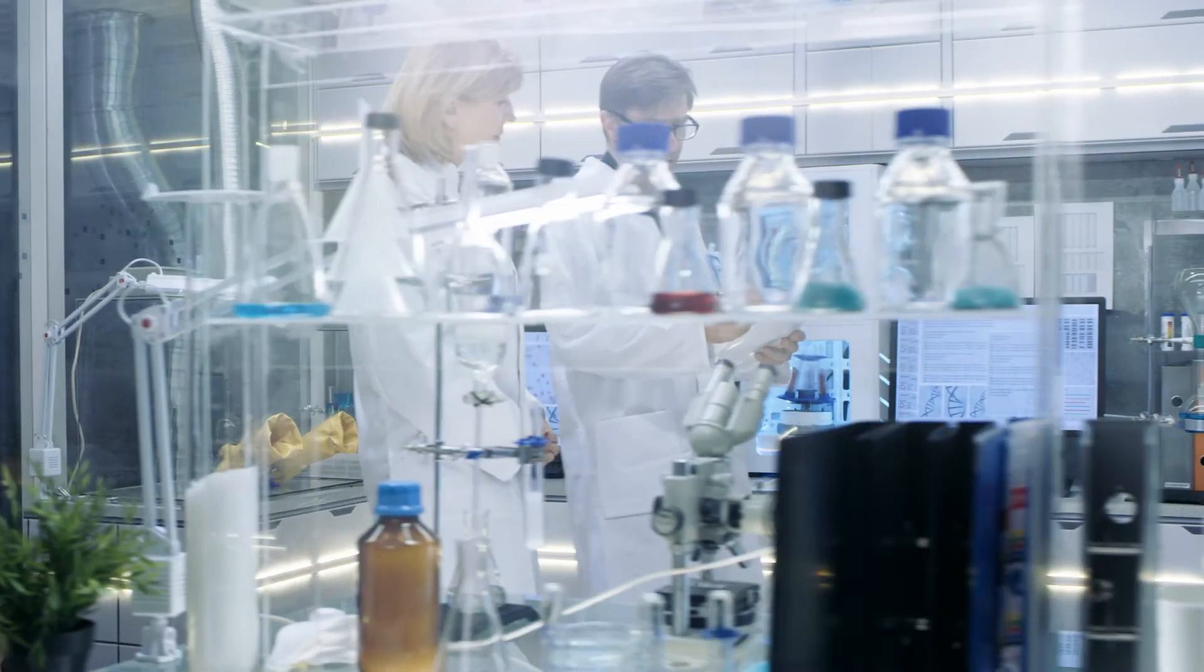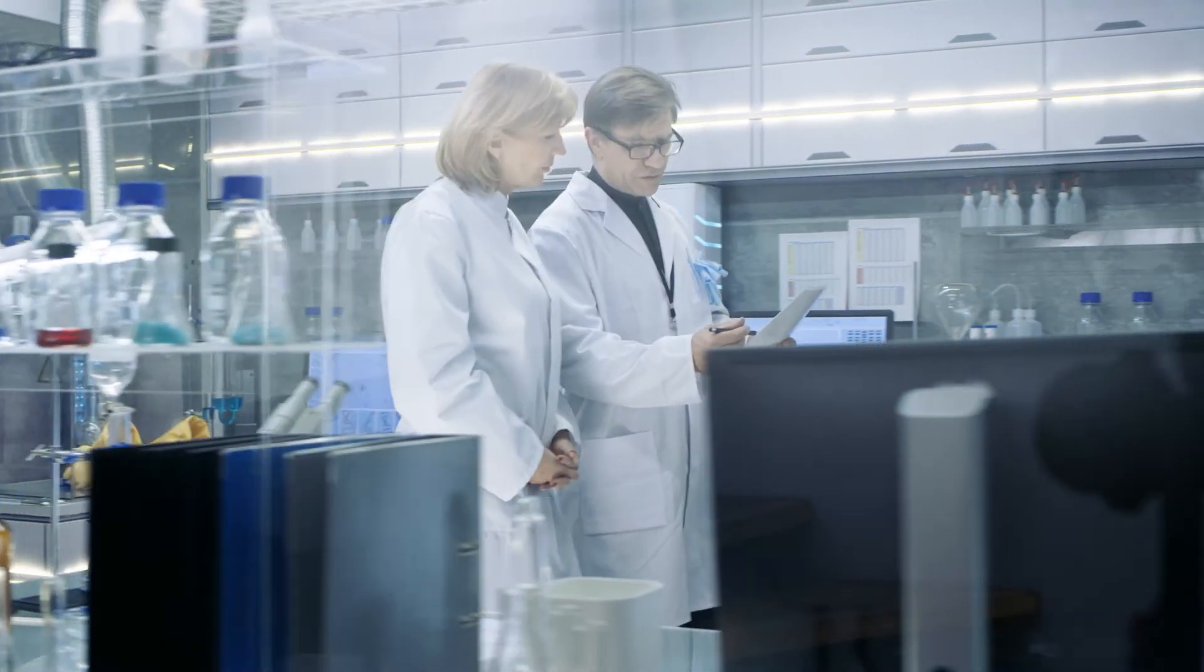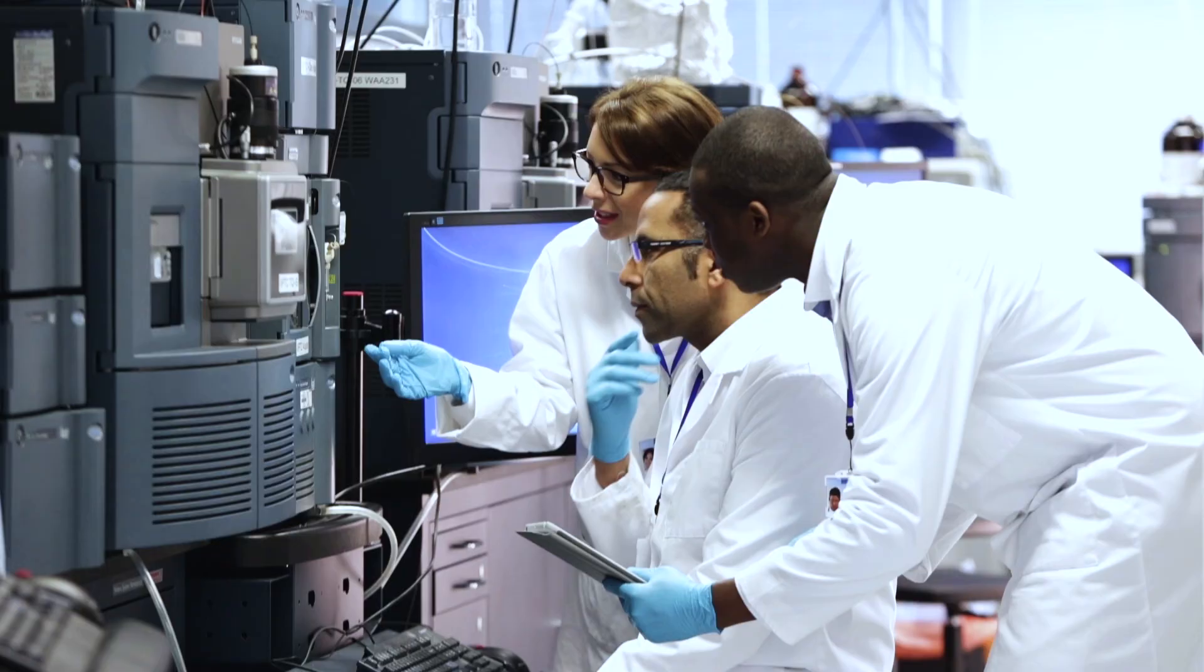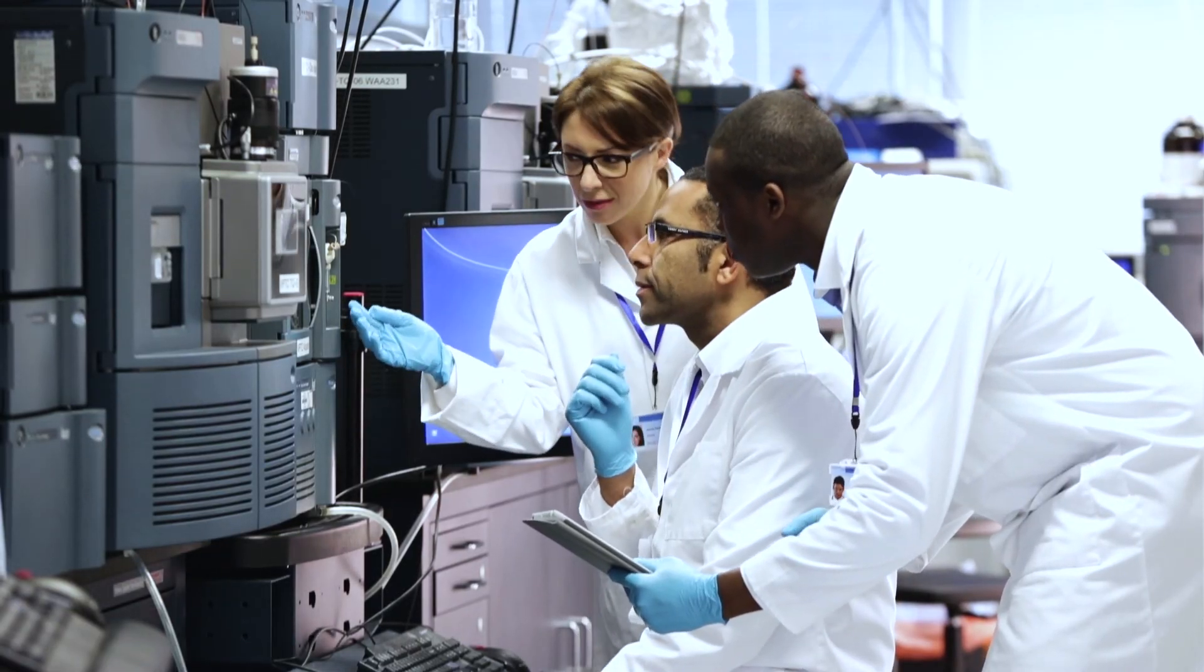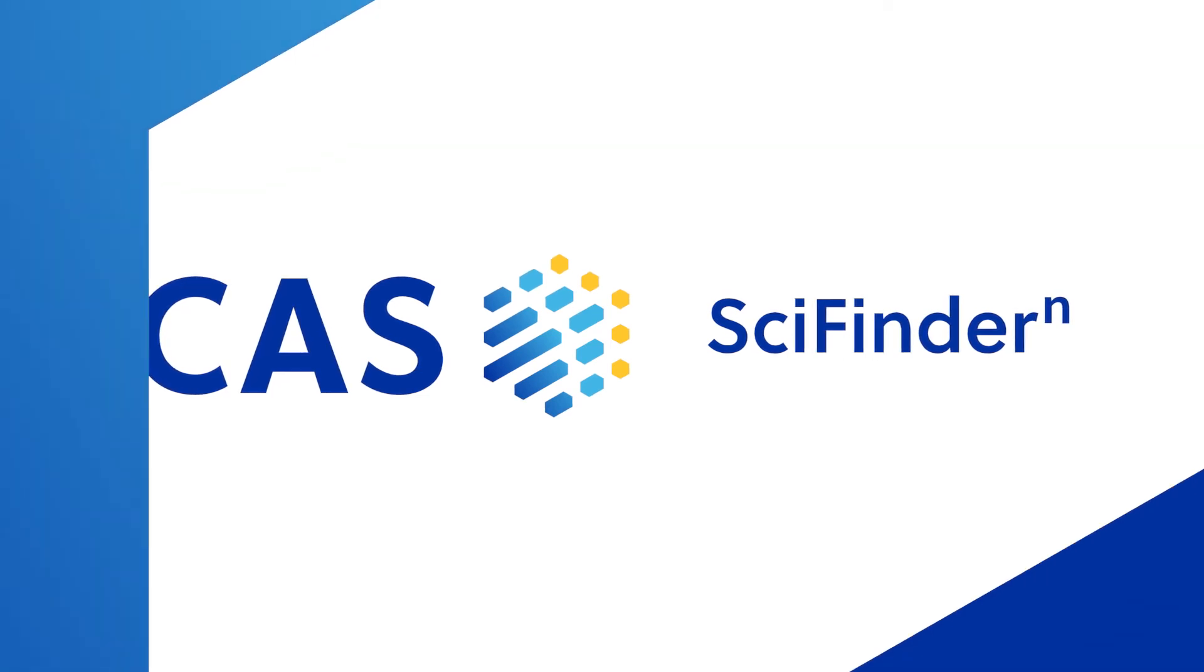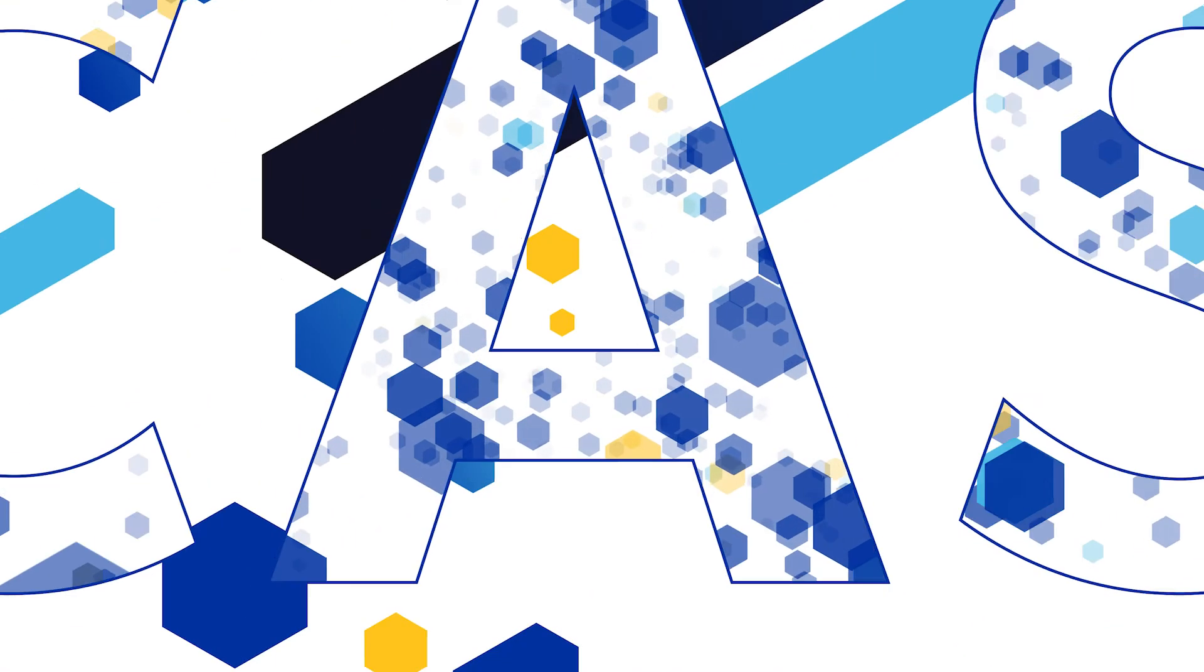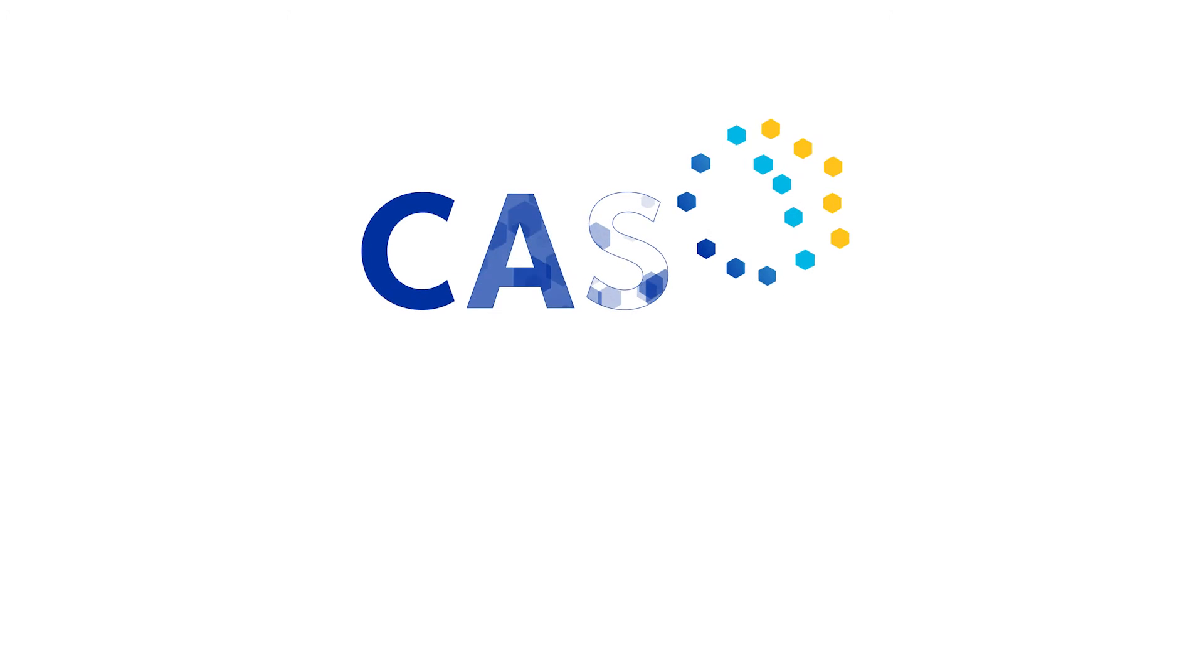Synthetic planning with SciFinder N provides you inspiration for new ideas, recaptured time allowing you to rapidly move your research forward, and confidence informed by the most authoritative source of scientific information provided by CAS.